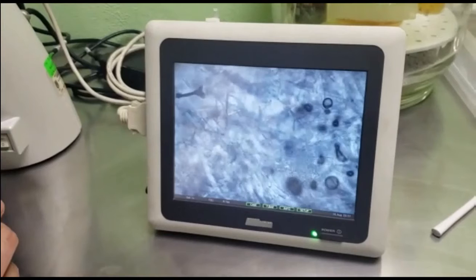In this screen also you can change the intensity of the light, you can change the parameters of the microscope, the parameters of the objectives, you can change the objectives, and also you can use the most important part, that is the scale bars, because we need to measure our samples, in the case of these fibers or cells that are presented in different materials, in different biological materials. For instance, in this opportunity we use light microscopy to check our samples.